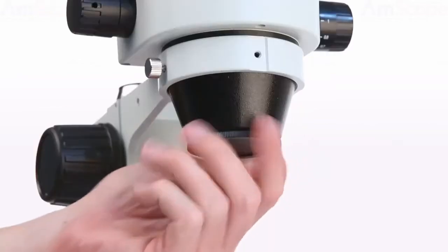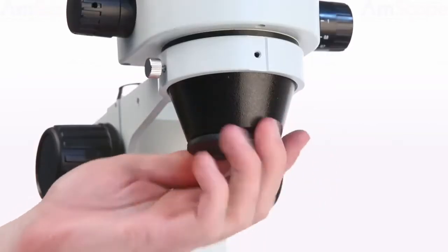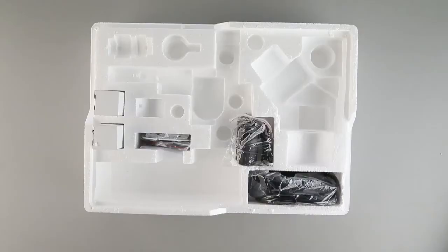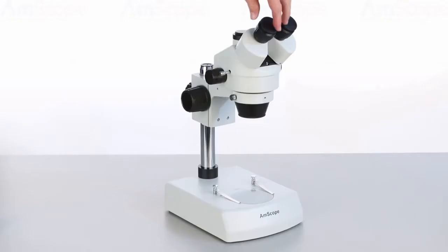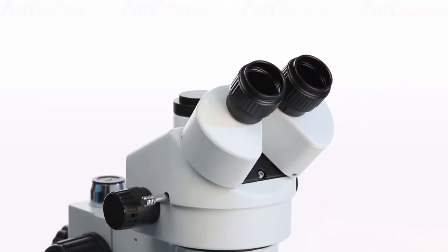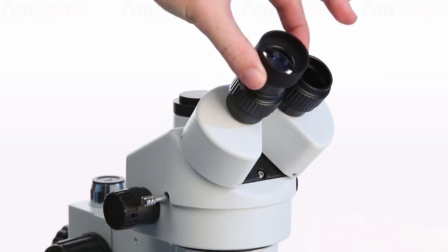Next we'll unscrew the lens cap to reveal the lenses. Now we'll move on to the eyepieces. Start by removing the dust caps on the eyepiece ports. Next, slip in each eyepiece.